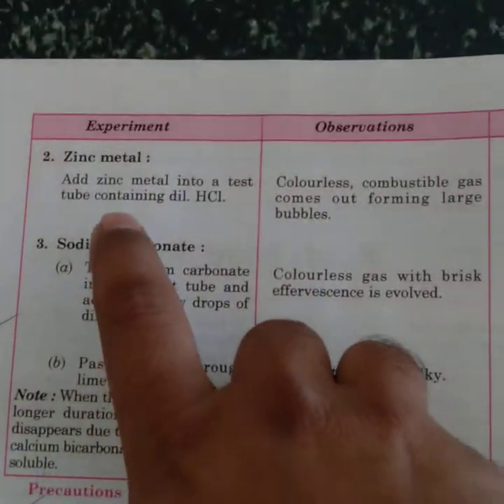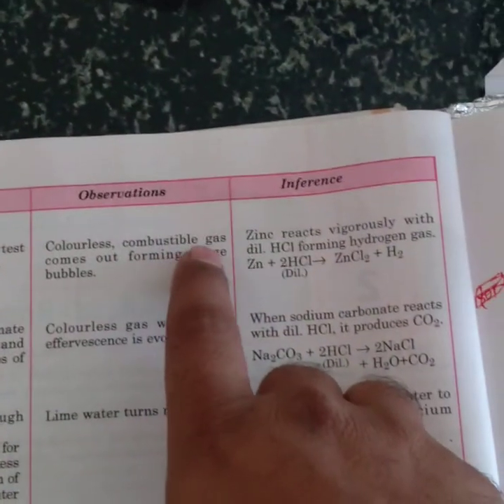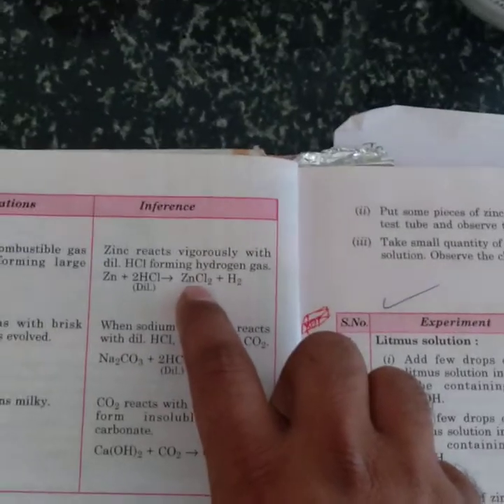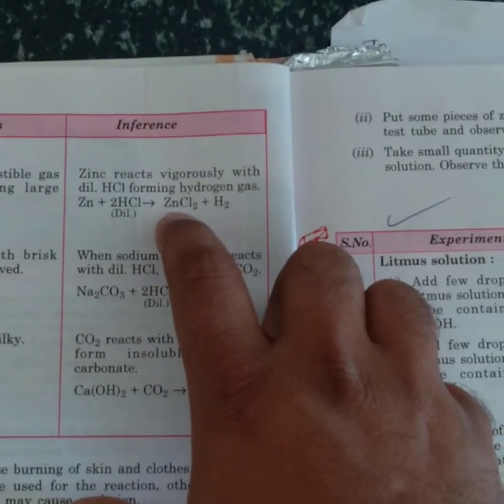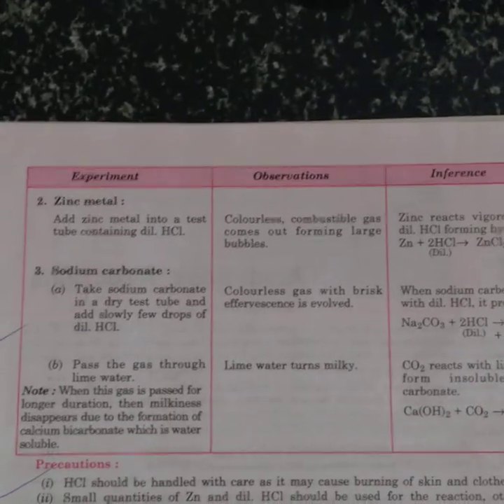We have added zinc metal to the dilute HCl. A colorless combustible gas comes out, forming large bubbles. The inference is zinc plus 2HCl gives ZnCl2, and H2 is liberated. The bubbles are due to hydrogen gas.